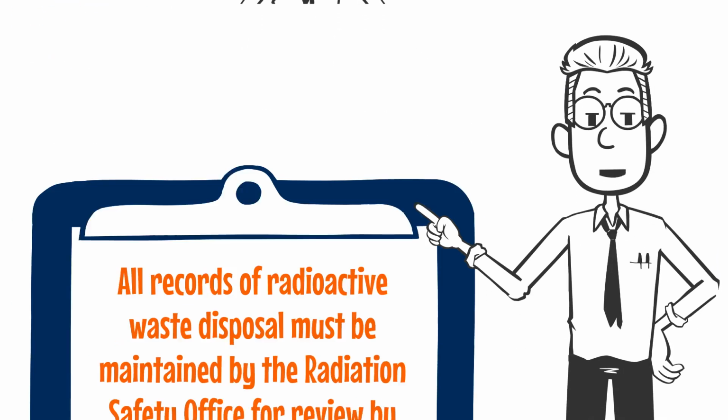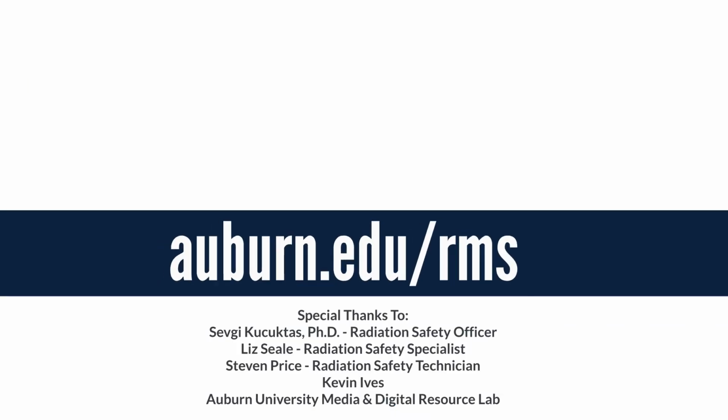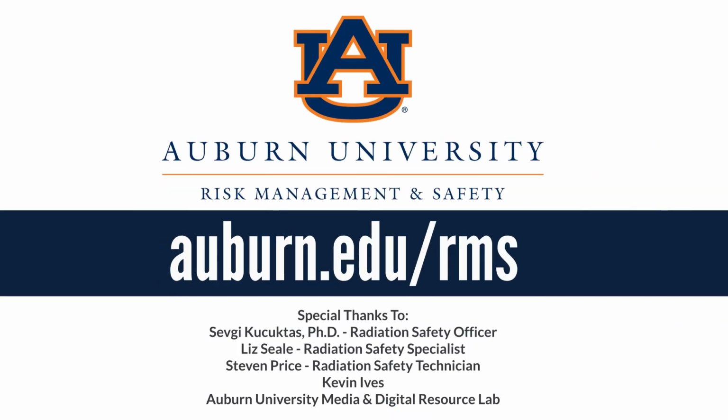All records of radioactive waste disposal must be maintained by the Radiation Safety Office for review by the Alabama Radiation Control Office. If you have concerns about radioactive waste, contact lab personnel or the Radiation Safety Office.